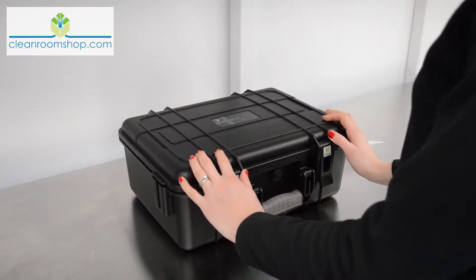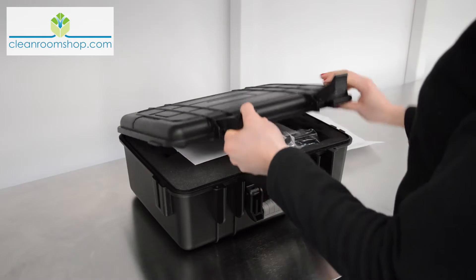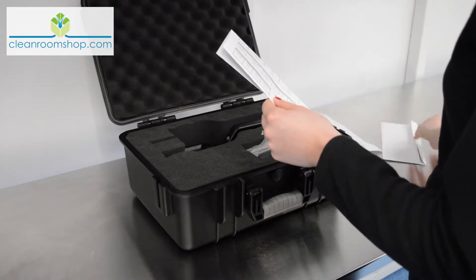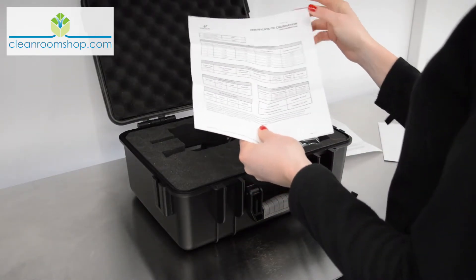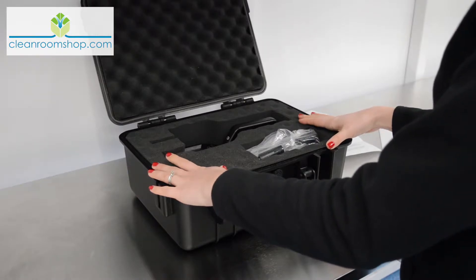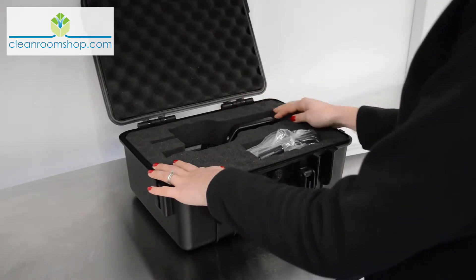The unit is packaged carefully in a secure solid plastic case. Let's open these two clasps and take a look. Lying on top is your calibration certificate and an envelope. This will show the date of the unit's last calibration and the next calibration date, which will be 12 months from its last calibration. The unit and accessories are nicely packaged, fitting snug in a custom foam insert which profiles around the unit to keep it safe during transit.